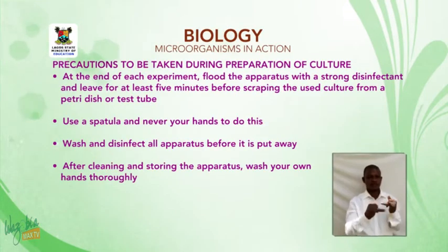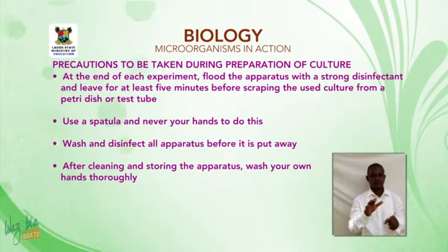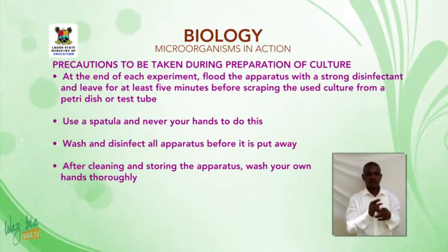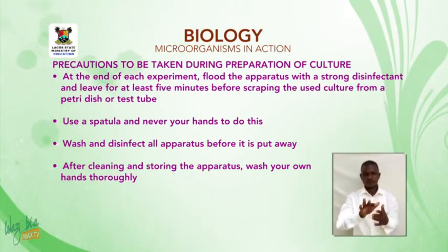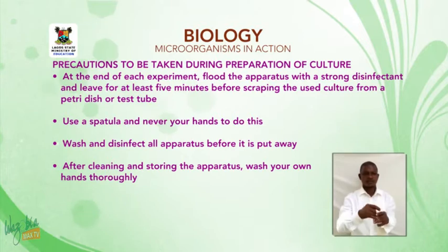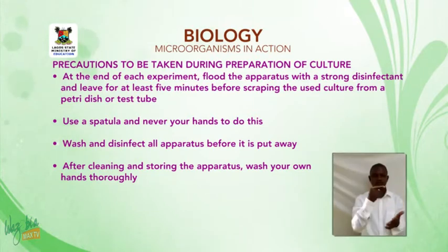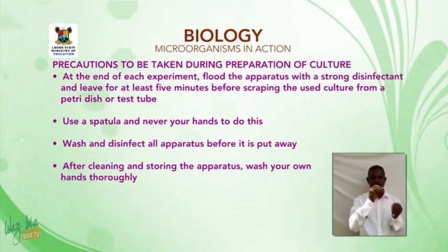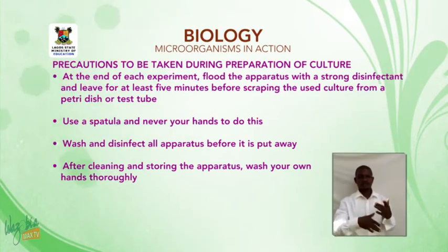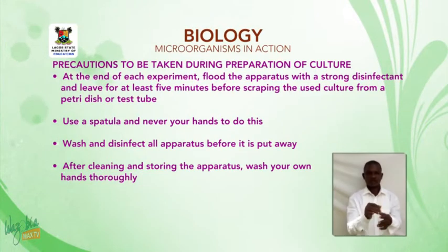At the end of each experiment, flood the apparatus with a strong disinfectant and leave for at least 5 minutes before scraping the used culture from a petri dish or test tube. Use a spatula and never your hands to do this. Wash and disinfect all apparatus before it is put away. After cleaning and storing the apparatus, wash your own hands thoroughly.